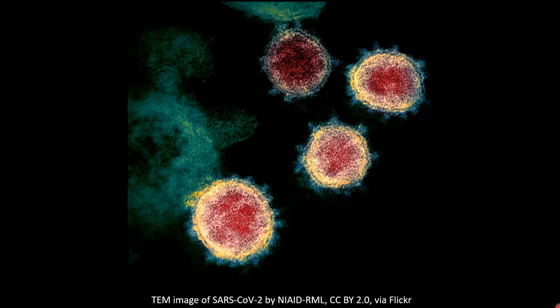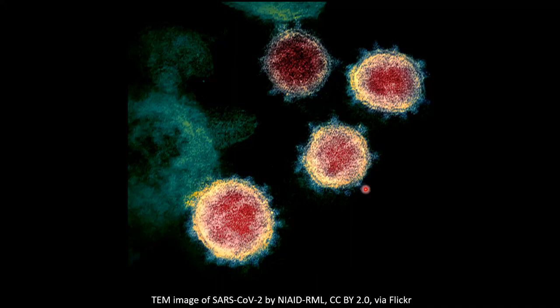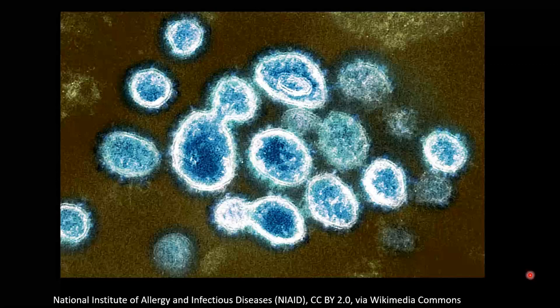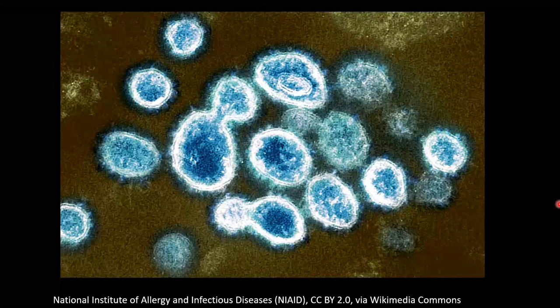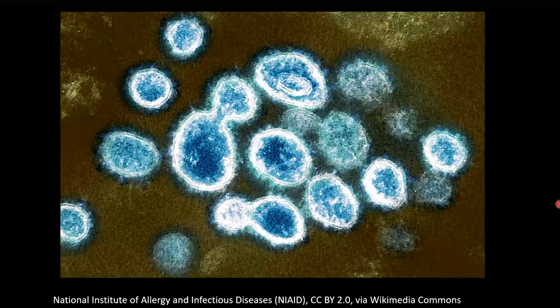This is the first of the NIAID's Transmission Electron Microscope images. You can see it's in false color — the original is black and white, and an artist went over it with color to highlight some of the features. This is why they call it a coronavirus, because it kind of looks like a crown with little gems all around the circle. This is another image from the NIAID, again false colored, and you can see not all of them are perfectly circular. Some have a more blobby shape, which contributes to some confusion because there are non-viral cell bits that look vaguely similar.